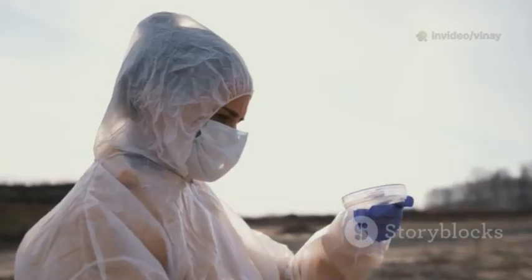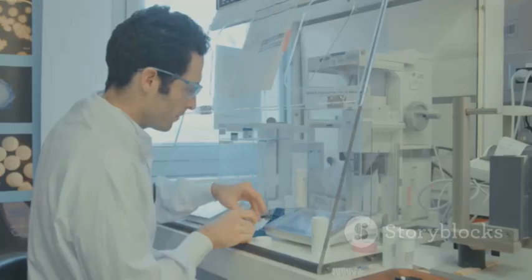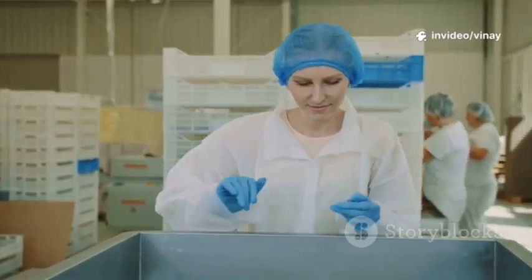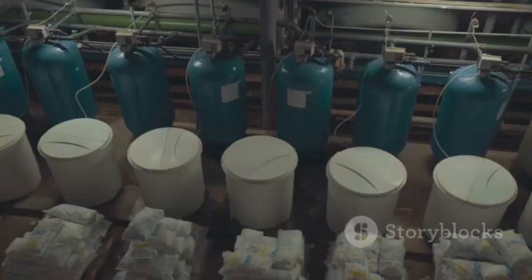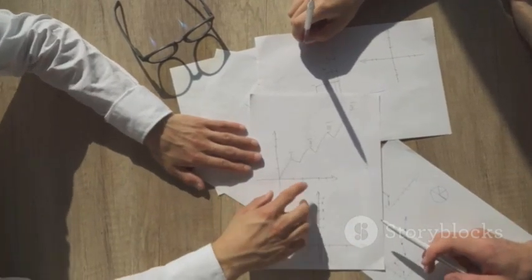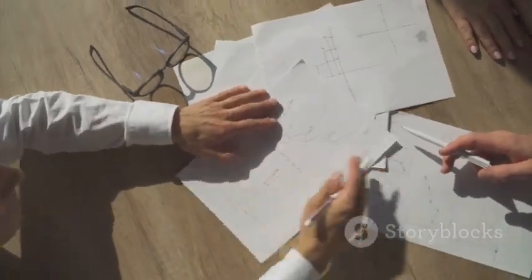If the test setup and procedure are confirmed to be correct, the focus shifts to the filter itself. The filter might be retested to confirm the failure. If it fails again, it is definitively non-integral. The cause could be a manufacturing defect that slipped through quality control, or it could be damage that occurred during shipping, handling, or installation. Sometimes the filtration process itself, with high pressures or aggressive chemicals, can damage the filter. Finding the root cause is crucial, not just for deciding the fate of the current batch, but for preventing the same problem from happening again in the future.